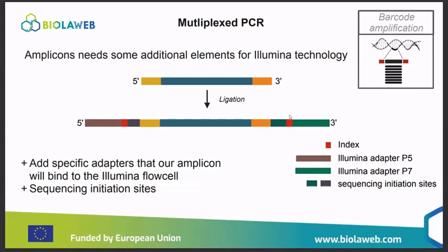And also it's because you don't need 50 millions of reads for one sample to assess the diversity and to have all the barcodes. You need fewer sequences, and you don't need to sequence as much as one run can do. That is why. It lowers the cost. Yeah.